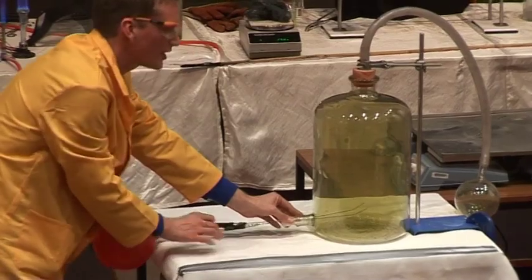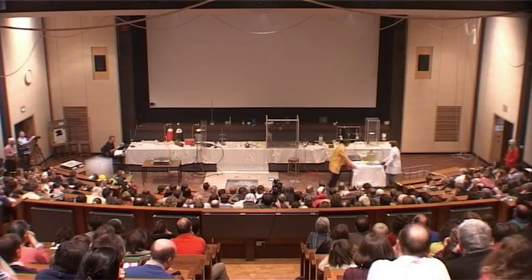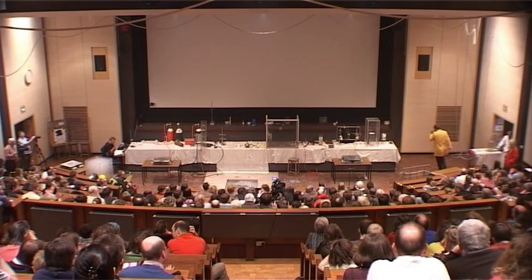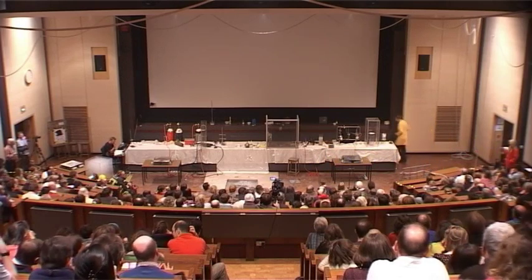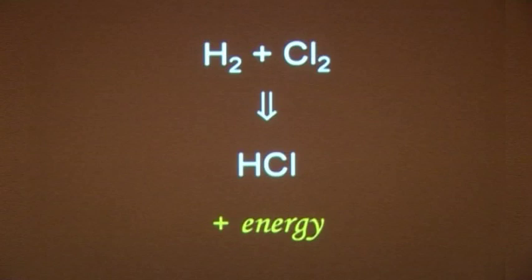There is no carbon being formed — it's only from the acetylene there. The hydrogen is burning by itself. So the hydrogen burnt in the chlorine, with no oxygen there at all, and the reaction that we saw is hydrogen combining with chlorine.